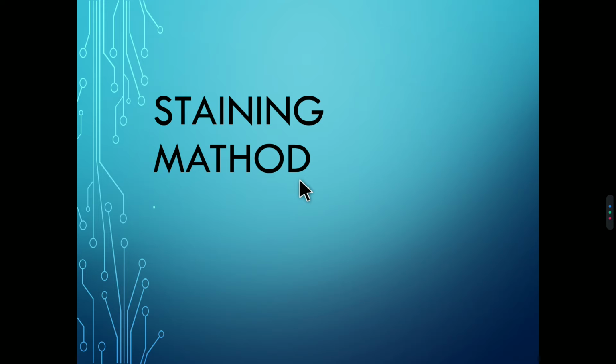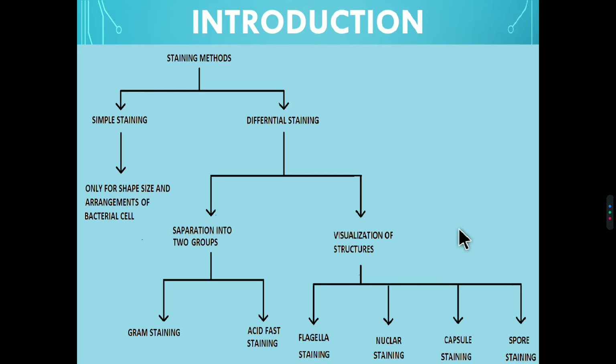By using the staining methods, we identify their shape, size and arrangements. In this video, I will discuss bacterial staining. So let's start the introduction about staining methods of bacteria.